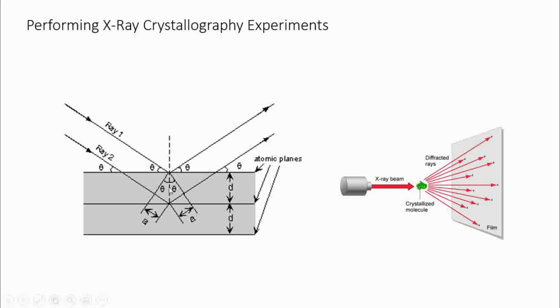And why? Because if you see, this is the wavelength and this is the diffraction for the first plane on the surface. But as we go deep inside, through multiple layers or multiple atomic planes, you see this is the distance between the atoms. Here the X-rays are coming, but this portion is not traveled in the first case. In the second one, this region is an extra distance which the X-ray travels just because it has gone inside.